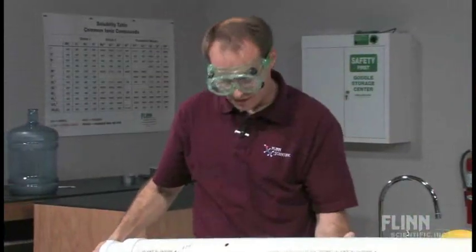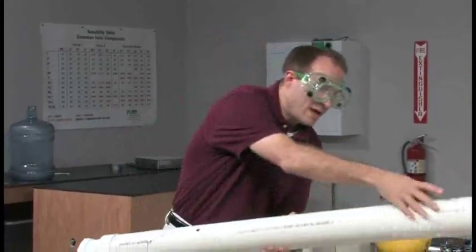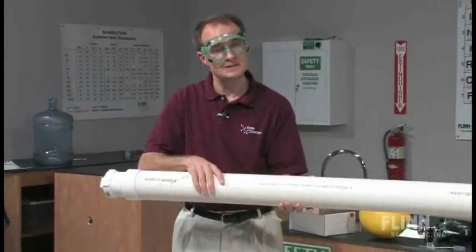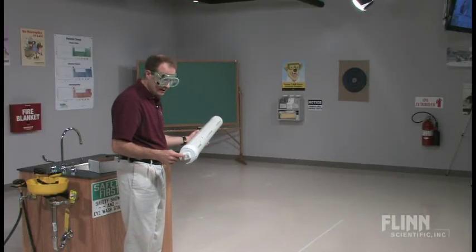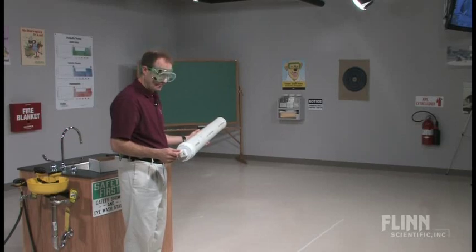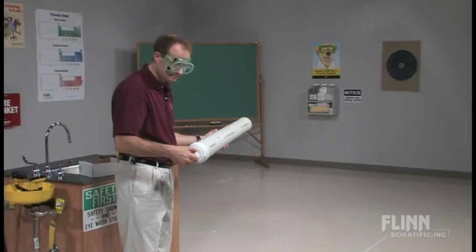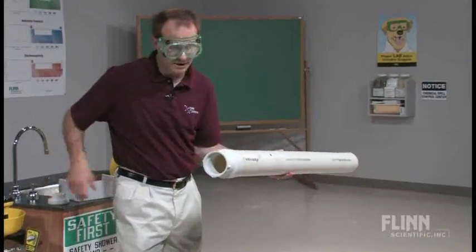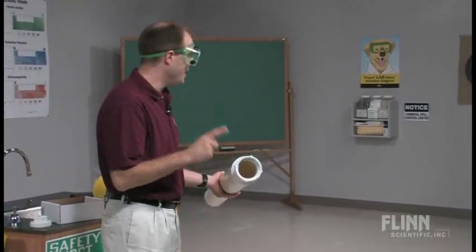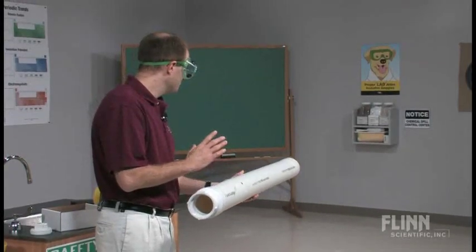As a teacher, you might be tempted — and many times students will say, 'Do it again, do it again!' — but we know as chemistry teachers that we have combustion byproducts still present inside the barrel of the cannon. That's where the clean-out really comes in handy, because all I have to do is unscrew this, and that will greatly assist me in putting fresh air inside the cannon.